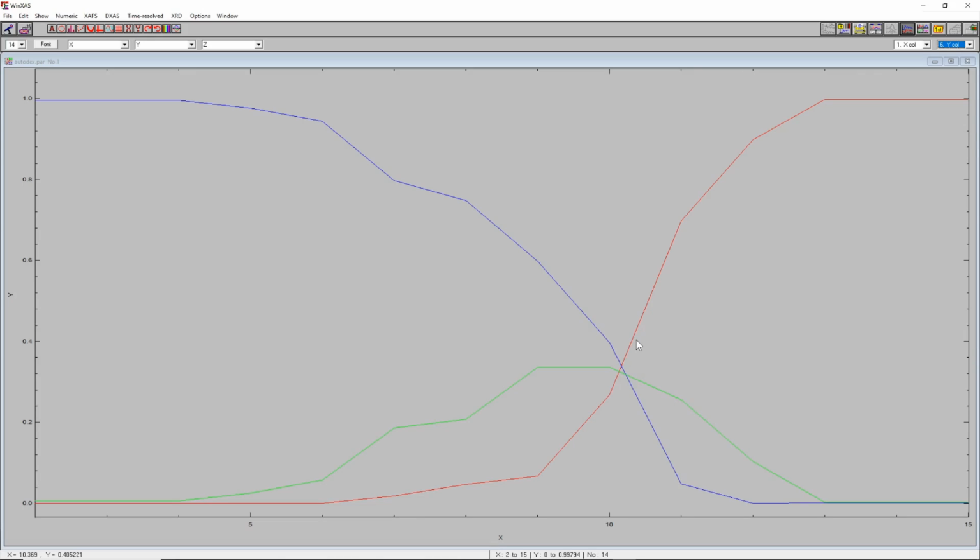The reference spectra really correspond to the reference to the phases in your experimental mixture. This will normally not be the case, especially if you measure in situ, operando, spectroscopy under reaction condition at elevated temperatures, temperature programmed, and so on and so forth. Then this will probably be a different picture.